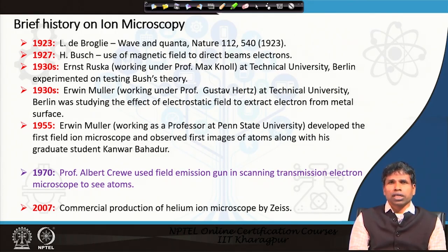Similarly, the electromagnetic lens is used in the microscope. Both these works gave a strong contribution to the electron microscopy community. Subsequently, after the 1930s, there were two world wars, and the work did not progress the way it had progressed before.